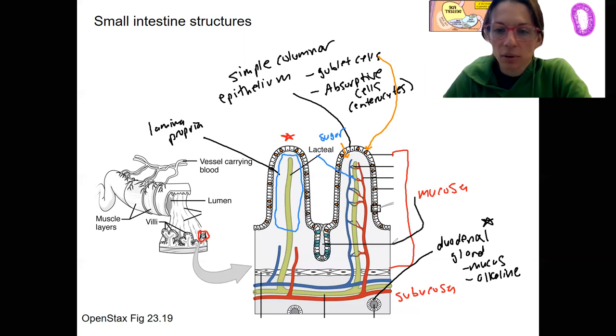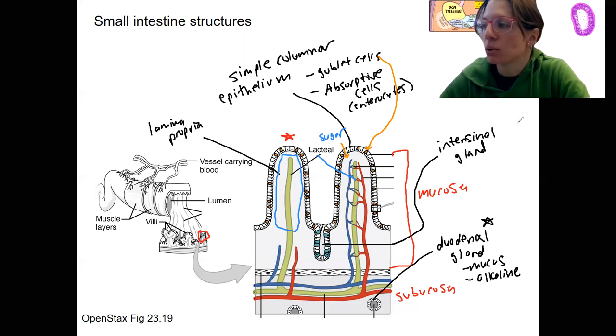The other structure is this one right here. This is, I'll label it up here, our intestinal gland or intestinal crypt. There are a bunch of cell types in here, the blue and the white, but it's actually a whole bunch. I'm actually going to do those in the learning outcome video. I'll name here which ones I want you to know. I don't have room to write down what they all do. I'm going to want you to know S, M, I, and G.